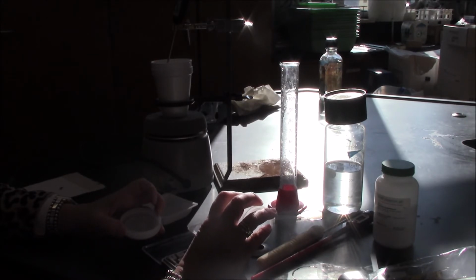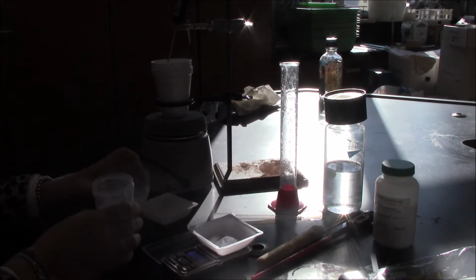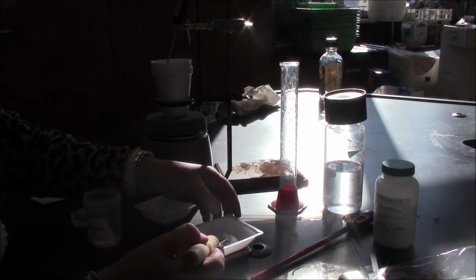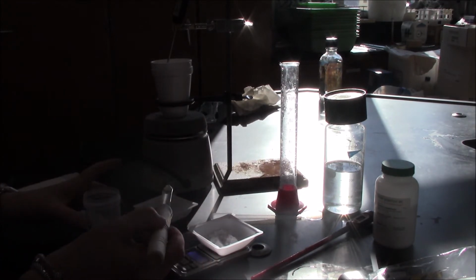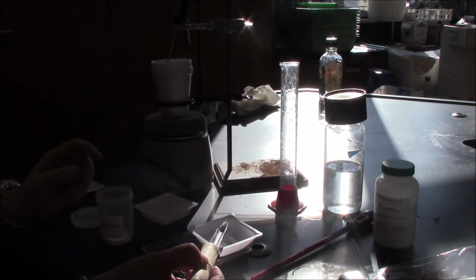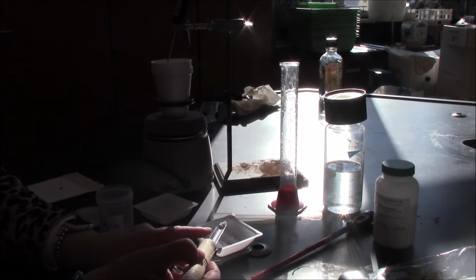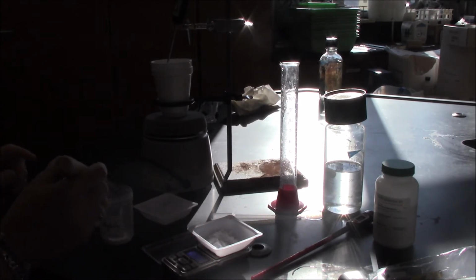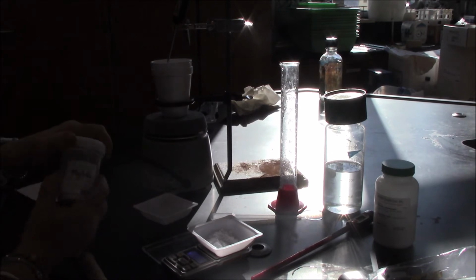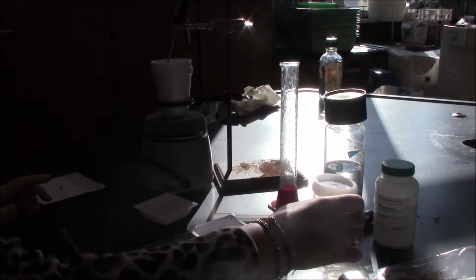Keep going. Okay. A little bit over, so 5.42. I'm going to keep removing it though. All right. I'm at 4.99 grams, and I'm going to record that value in my data table.